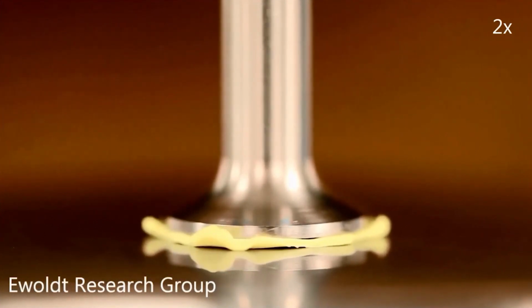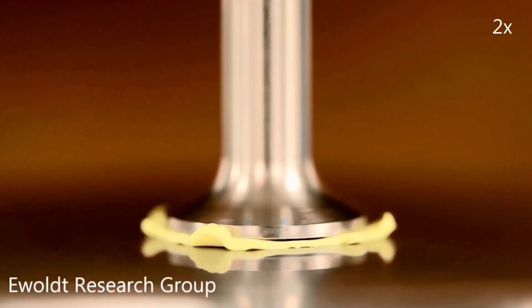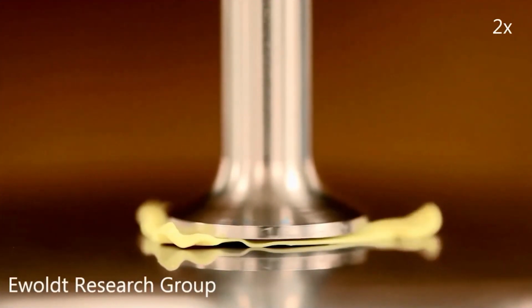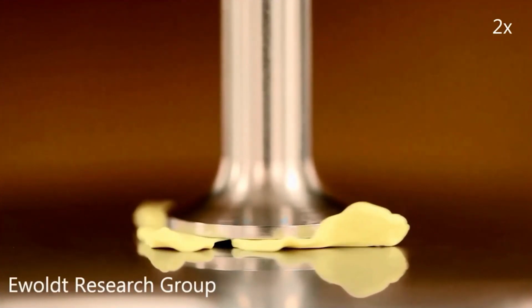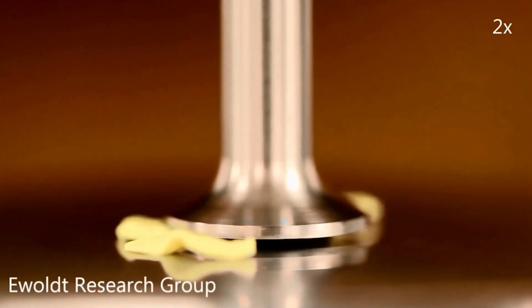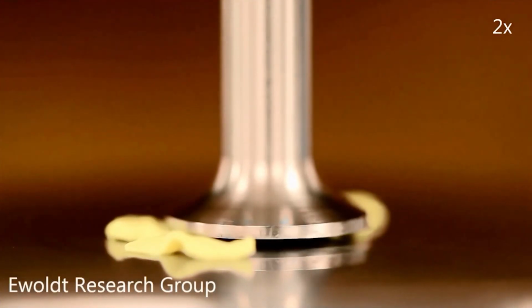And if you just looked at the data from torque and displacement, you wouldn't be able to tell that this is happening necessarily. It looks like the material is shear thinning and softening. And in fact, the material feels a setup that is indeed softer and easier to deform because the material is leaving the gap. You have less material to deform, it's coming out of contact with the plates, and it is easier to push this material around. And this definitely is not rheology, or it's sort of rheology, but it's not a material function that you'd be reporting with a test like this.